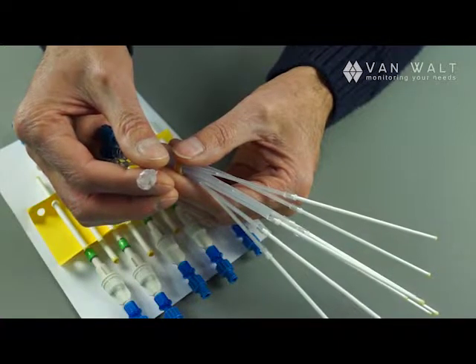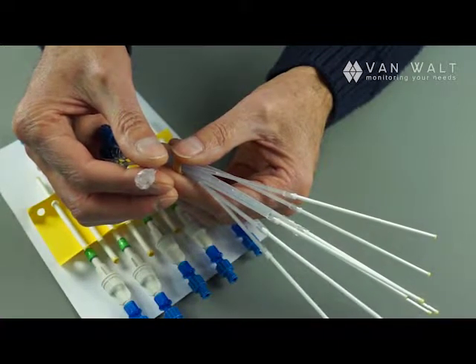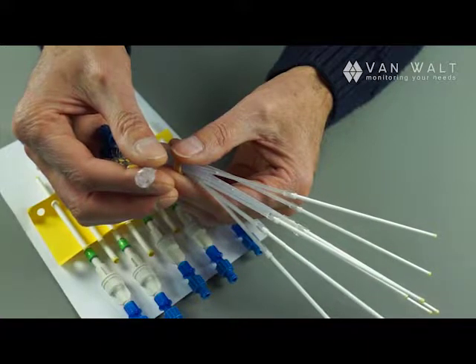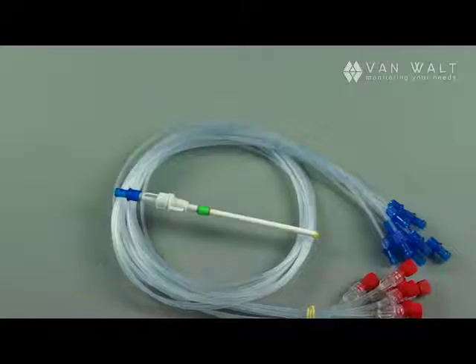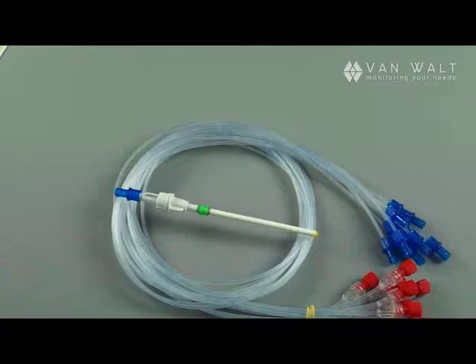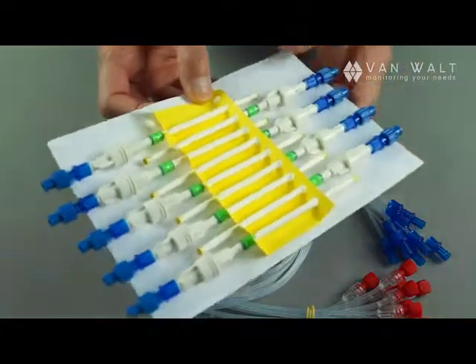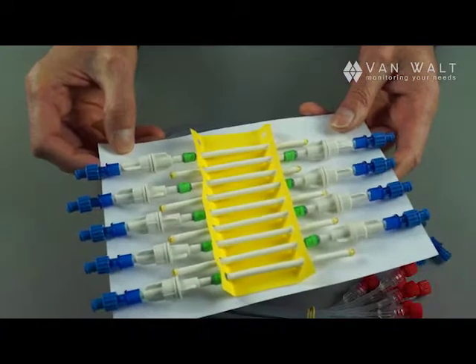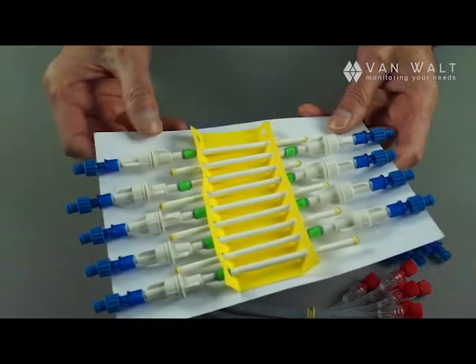But of course we do have male to female Luer adapters if that is a requirement. All rhizomes are sold in packs of 10, be they macro rhizomes or micro rhizomes.